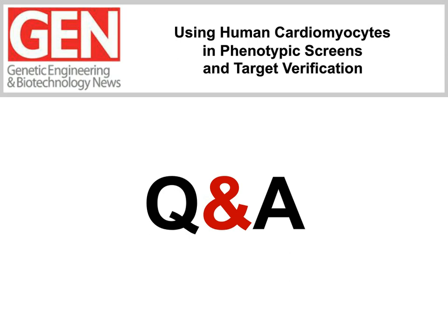Siobhan, this is one of the only stem cell-based screens in 1536 wells that I know of. Will the methods and or results be published, and will this be offered as a screening service? Yeah, so we are working on a publication, trying to get that out.